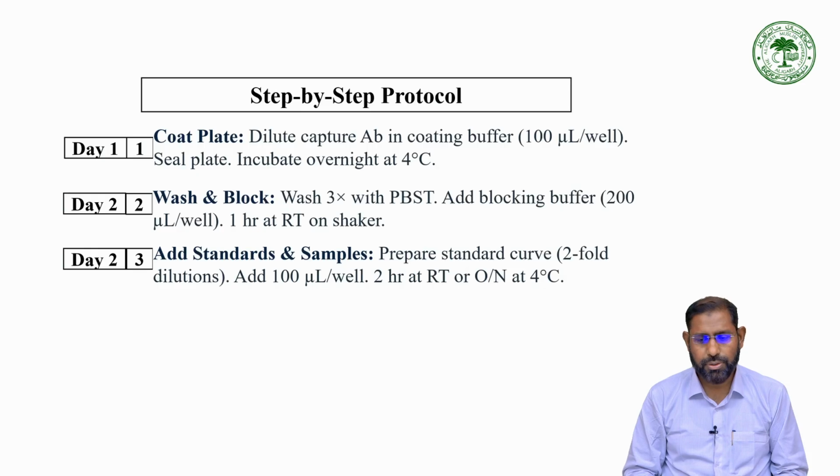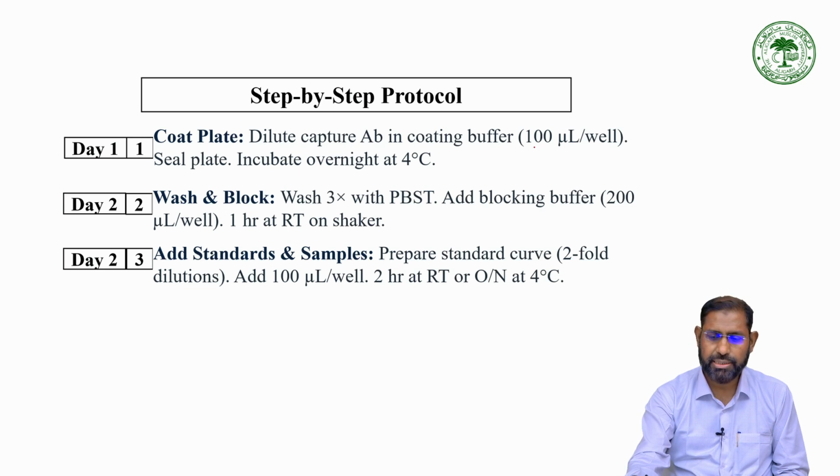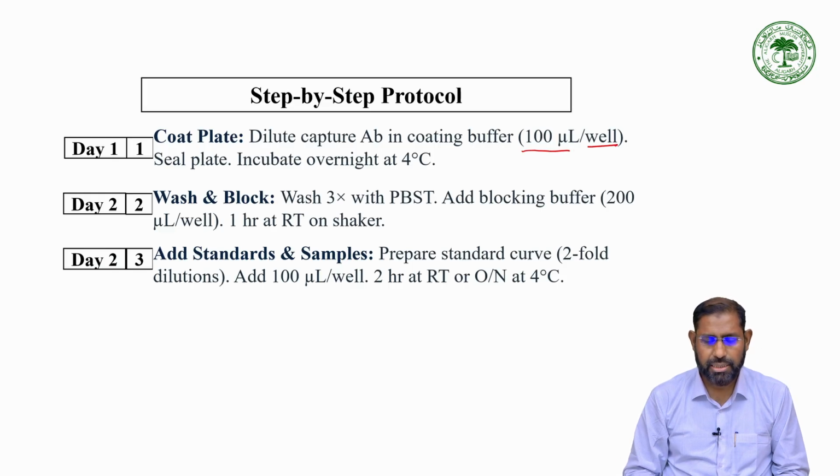Step by step protocol. Day 1, first step, coat the plate. Dilute the capture antibody in coating buffer, that is we have the concentration 100 microliter per well, seal the plate and incubate overnight at 4 degrees.